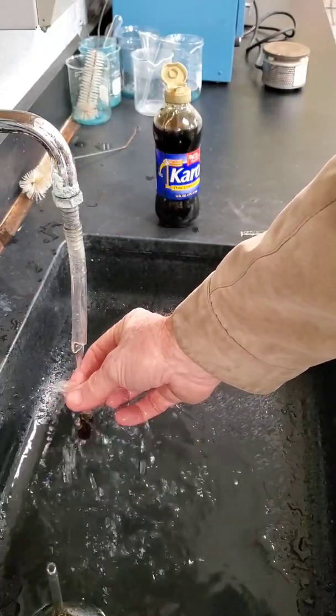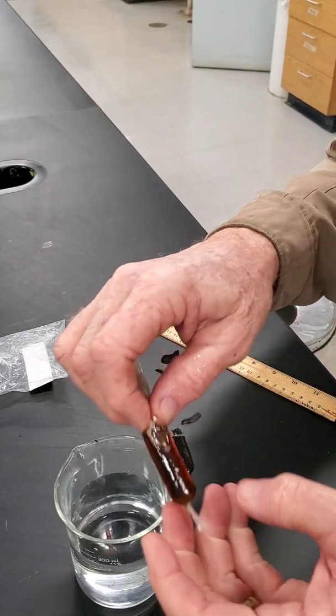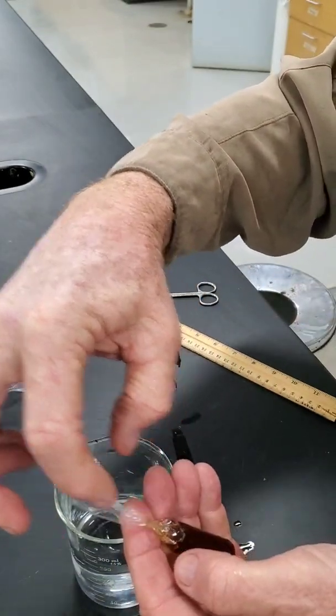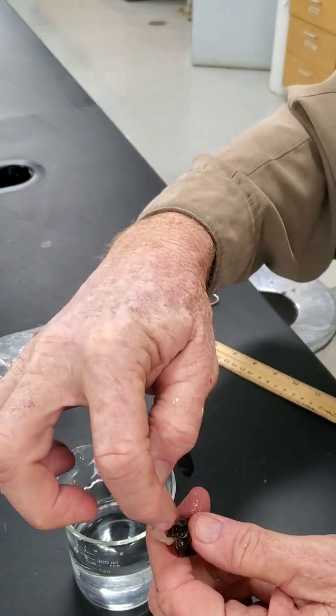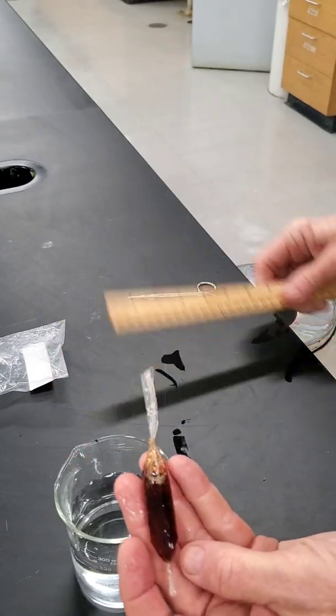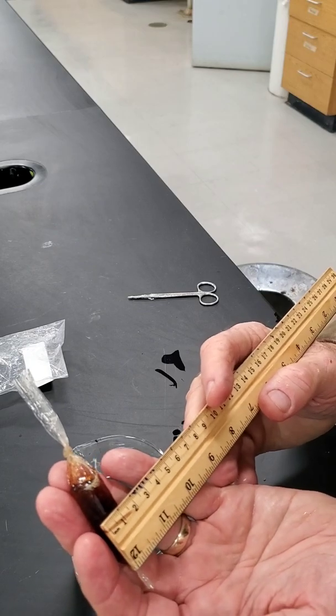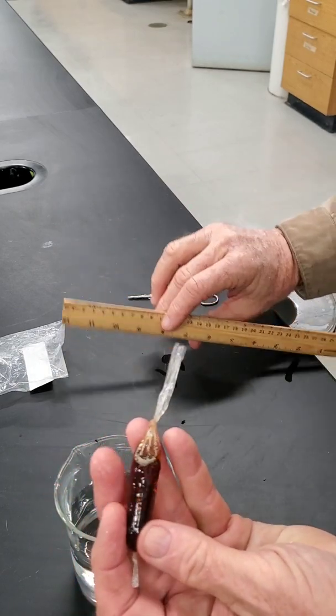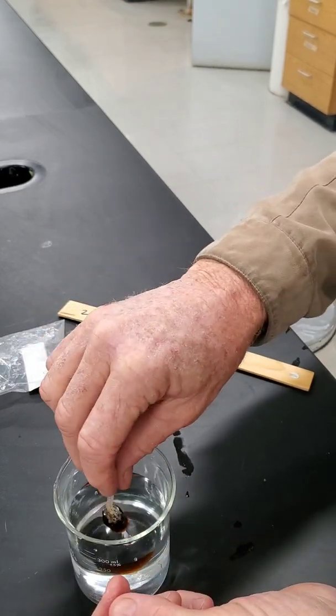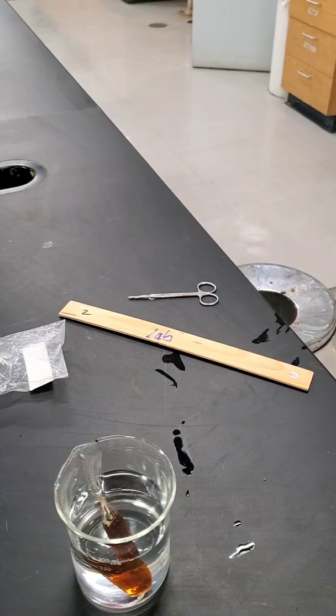Now we need to rinse it off really good and get all the sugar off the outside of it. We rinsed it off thoroughly. Let's just remember what it looks like. The width of it in centimeters is about 1.5 centimeters or 15 millimeters across. We're just going to drop it into our little beaker of distilled water and now all I have to do is wait for a few minutes and see what happens.